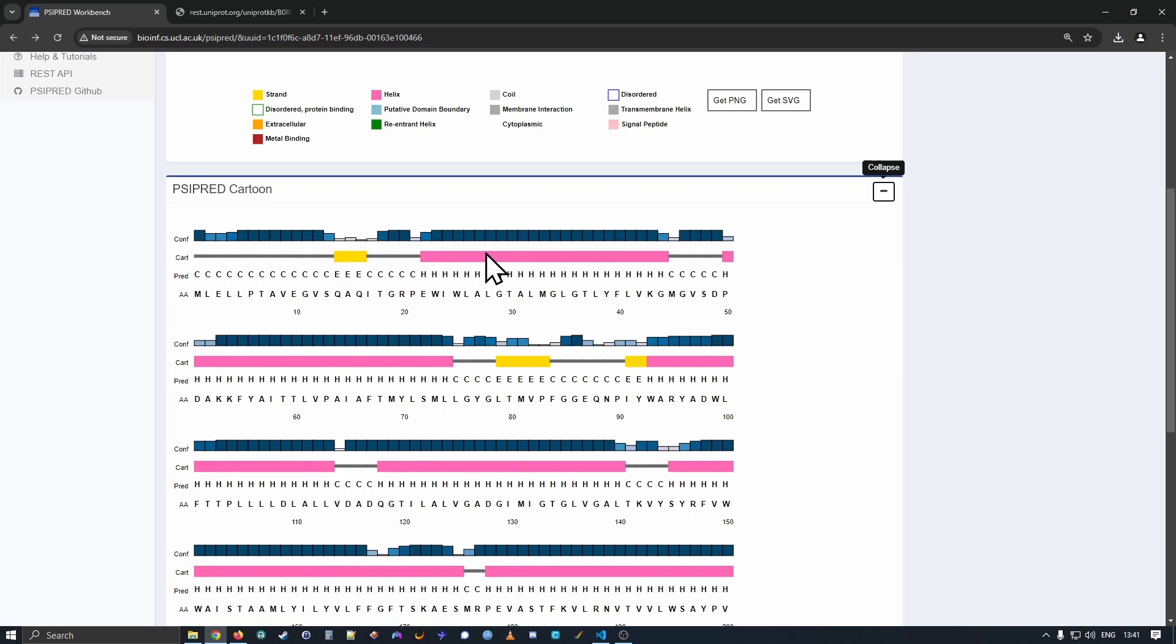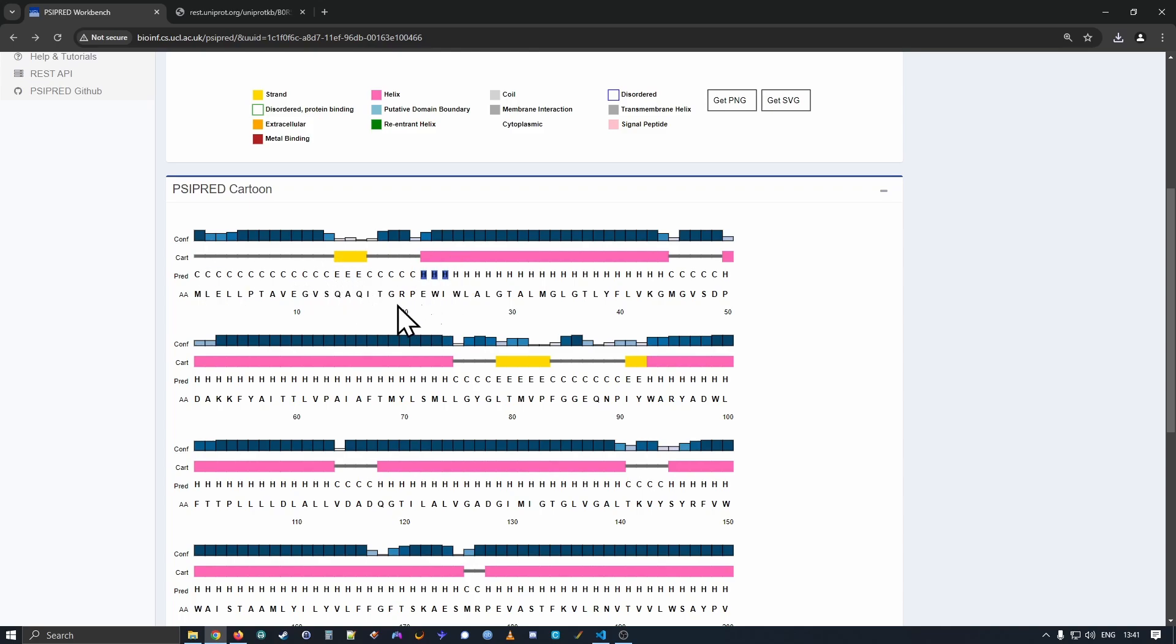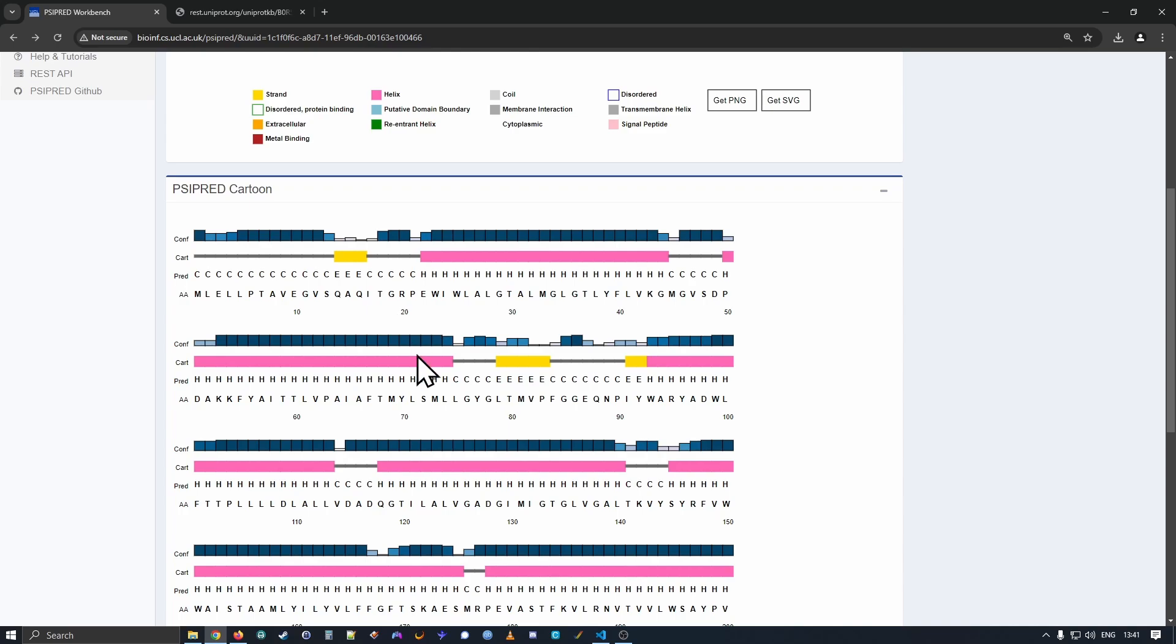We then have another little cartoon diagram of the secondary structure content: grey for coil, yellow for strand, and pink for alpha helix. We then repeat this in the prediction row. So C for coil, E for beta strand, and H for helix. These are just the standard letterings for these annotations. And lastly, at the bottom, we have the sequence. Our coordinate information is noted below.